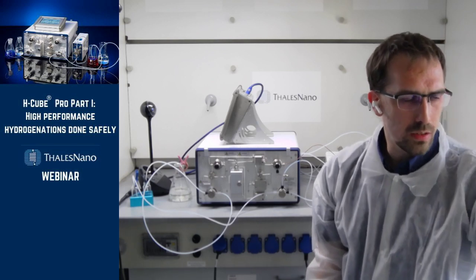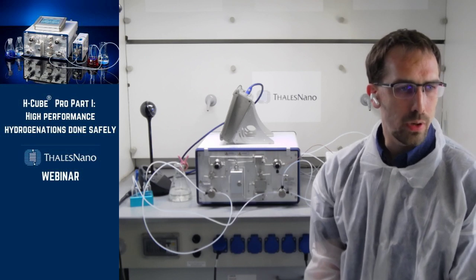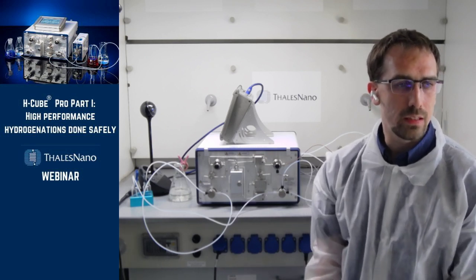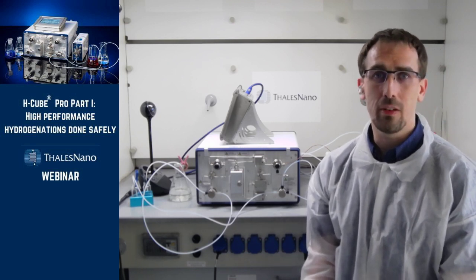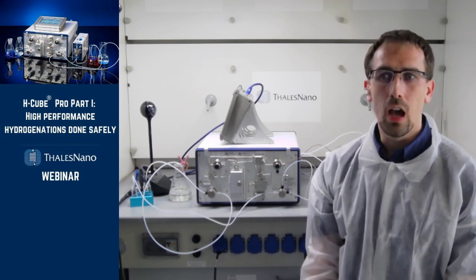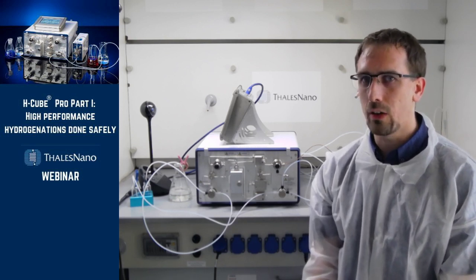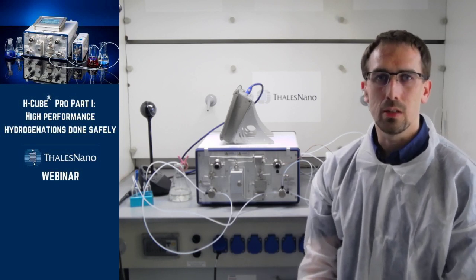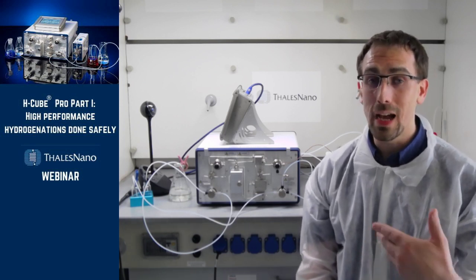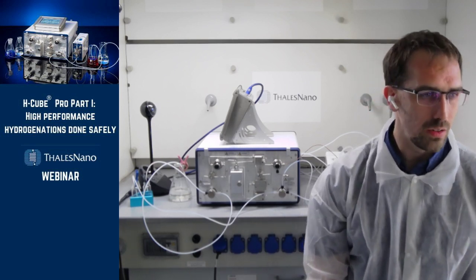So the next question is whether you can use the H-Cube Pro to perform only deuterated reactions or deuterations, and whether there is any negative impact on the electrodes. The important thing is that you need to use high quality D2O for your purposes. So try to buy the best D2O available on the market.